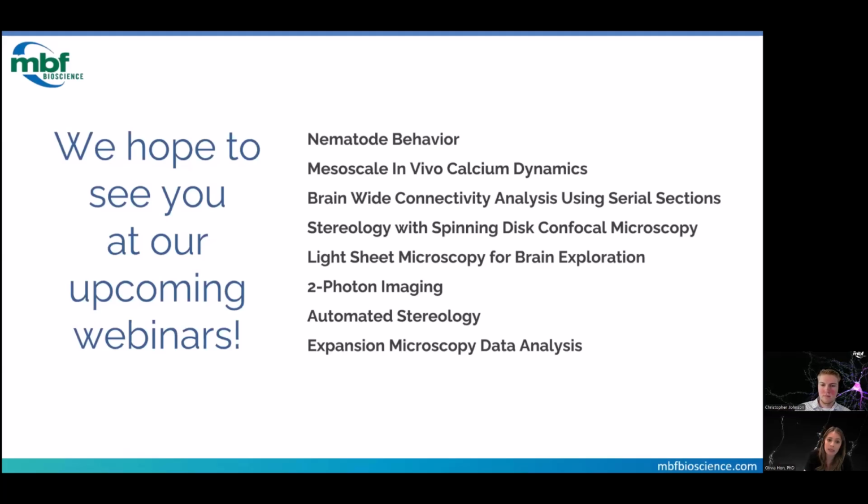Another option is to actually fit the 470 signal to itself and flatten out that way. It's a little trickier because if you have a really big event that occurs within that window, then you can skew your signal a little bit. But if you make your buffer size long enough, you should still be able to do it that way. So I think whatever controls you use, it's possible to modify the workflow to then use that to flatten out your signal.